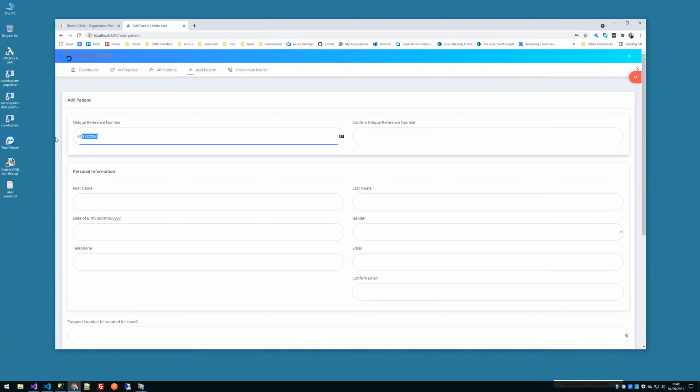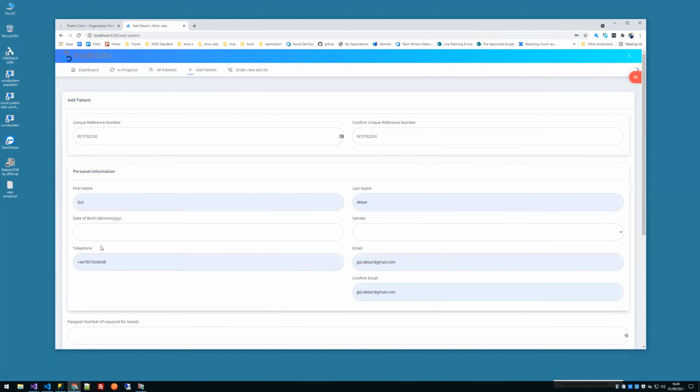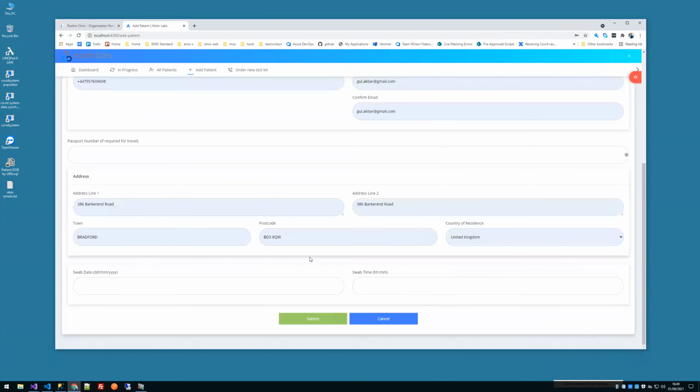Let's copy and paste that. I just put myself in, it's easier. 21st, 12, 1980. Yes, I'm old. Oh, that's your real birthday? Yeah, it's easier to write.